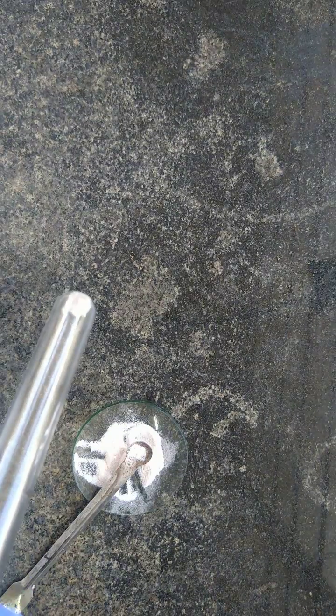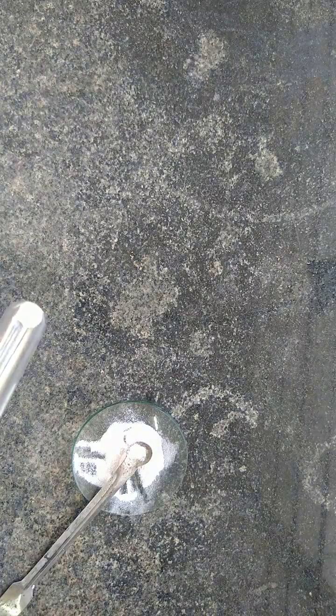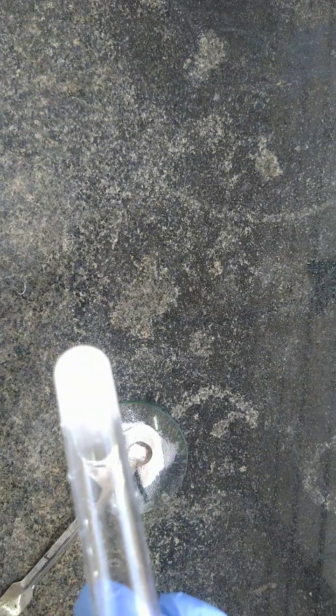So look at the observation. You can see here we are getting the white precipitate. So the observation is white precipitate, and the inference is that sulfate is present.